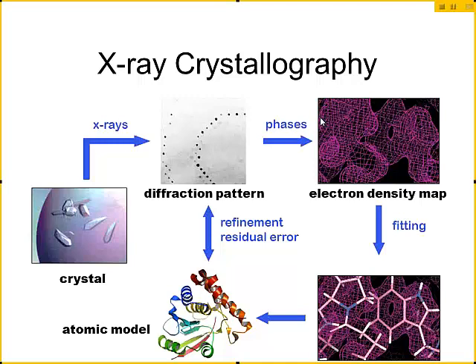Those crystals are exposed to X-rays and you get a diffraction pattern. So the X-rays interact with the electrons in your atoms and they scatter. And they're going to scatter according to the pattern of the electrons or the packing of the molecules within your crystal. Now I'm going to just wave my hands here, although this is a real time sink for the experimentalist. But part of the information the experimentalist gets is location of the spots on the film and their light or darkness. That's half the information they need to solve the structure.